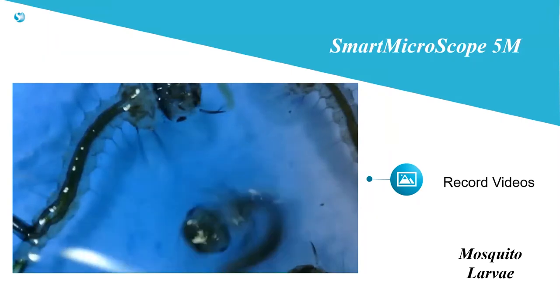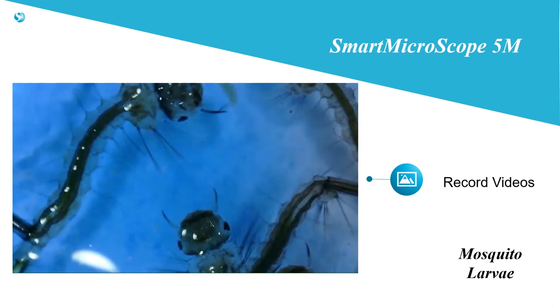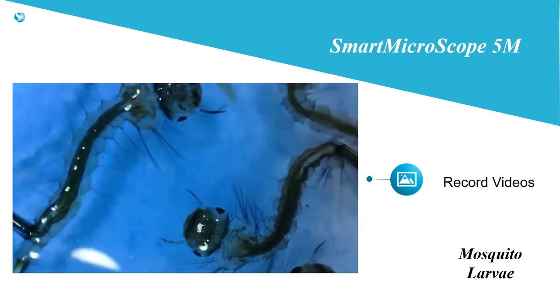The HD image is perfect for projecting for all students to see at once, record videos for review, or to share with students who missed class.